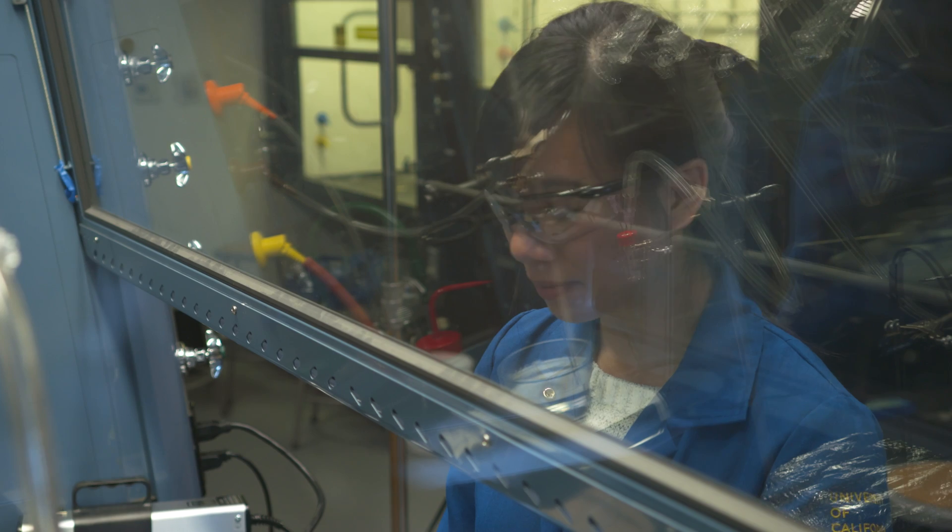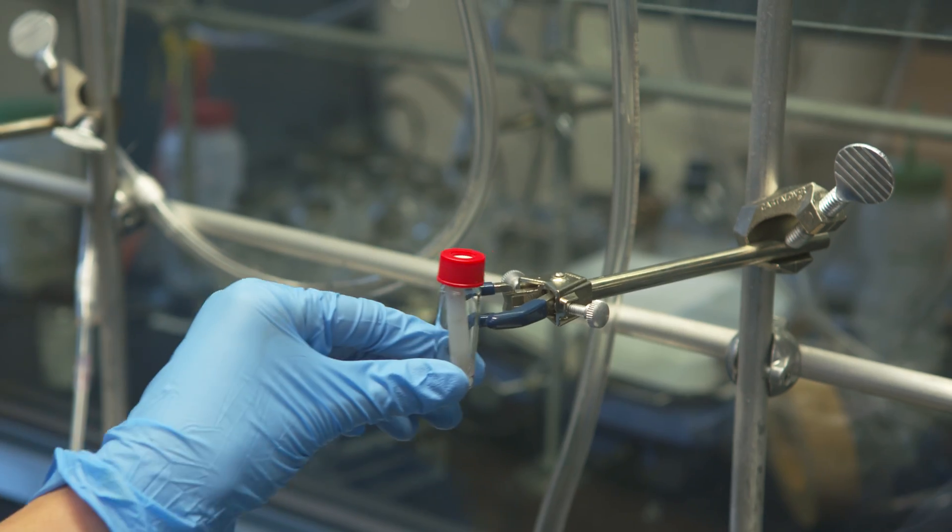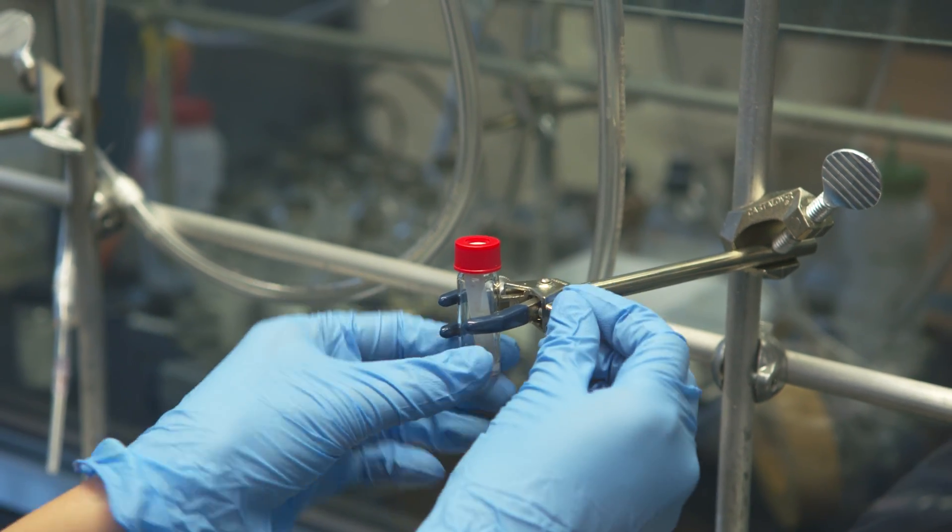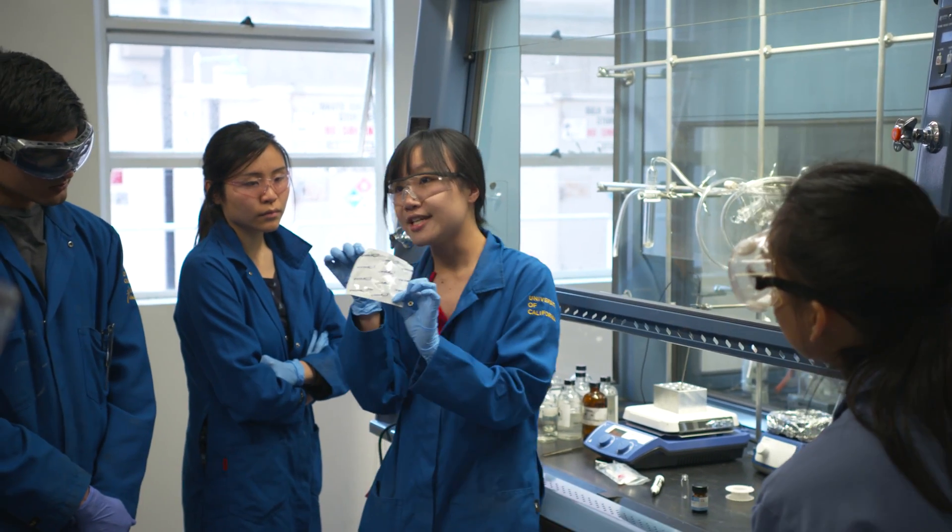So undergraduate students are going to be using these capsules and performing the nickel catalyzed esterification of amides. This is an organic chemistry laboratory course taught by Professor Shu Ming Chen.